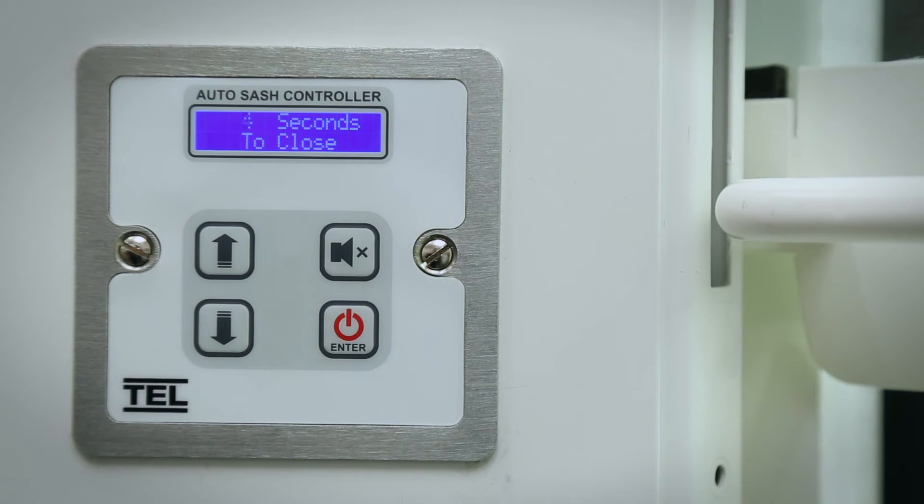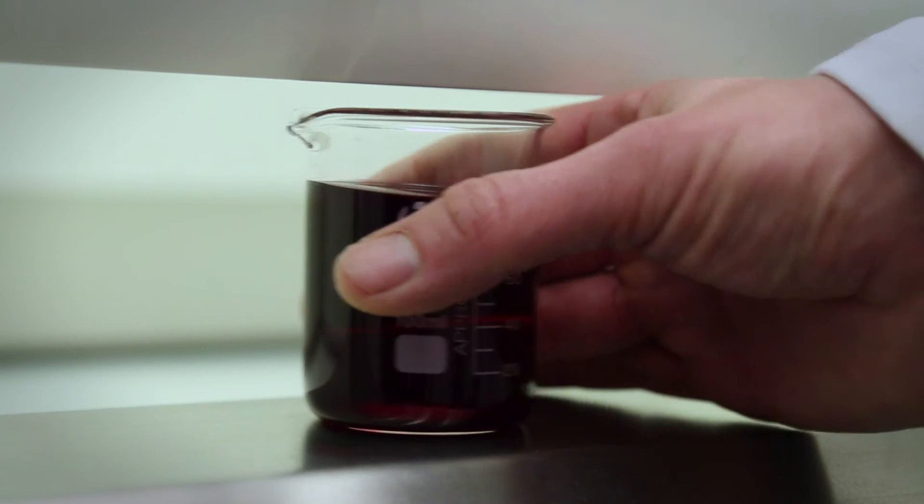The light curtain creates an infrared zone over the working range of the sensor. If any obstacle is within this zone during the closing sequence, the auto sash drive is disabled displaying audible and visual alarms. Once removed, the auto sash will automatically reset.